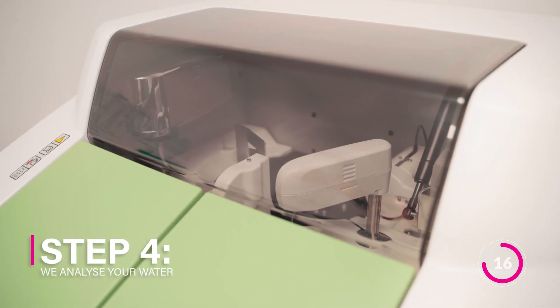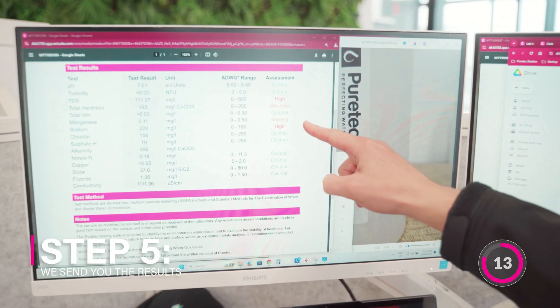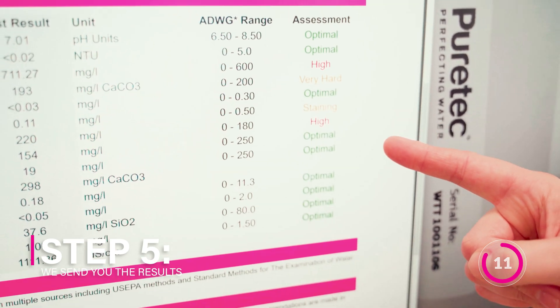Step four, we analyse your water. Step five, we send you the results and recommend a suitable treatment system.